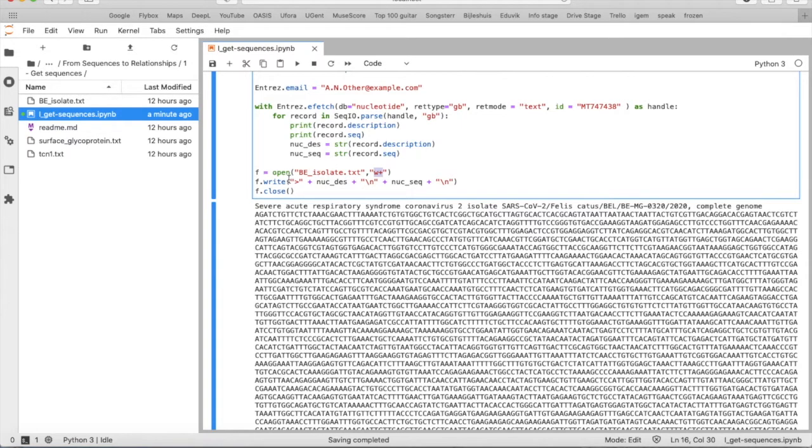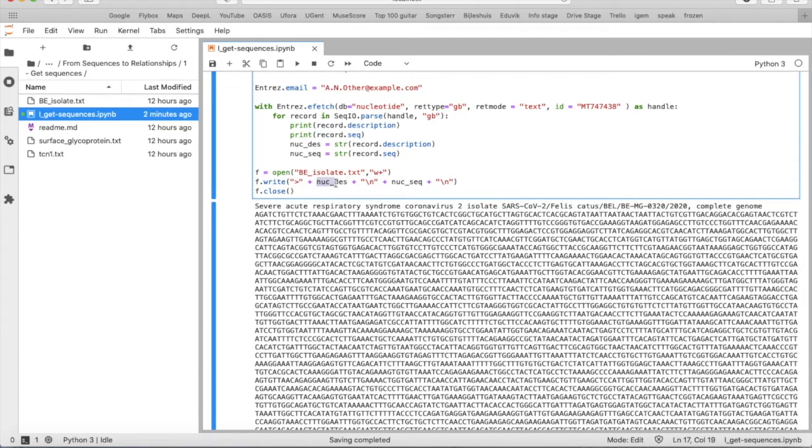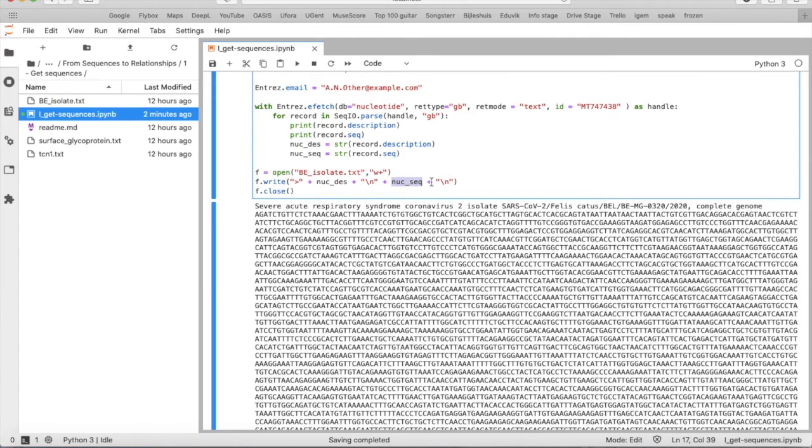Then what do we write? We write a new FASTA file, so first of all the FASTA file symbol plus the description plus a new line plus the nucleotide sequence and then you finish with a new line as well.